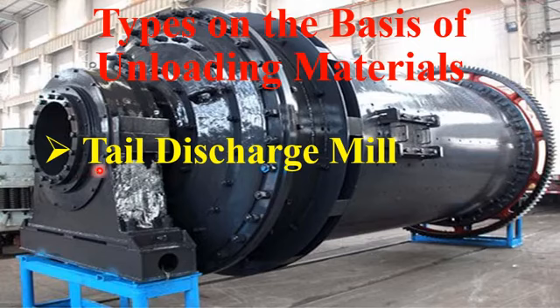So in tail discharge, the head and the tail of the ball mill drum are used as an inlet and outlet for the bulk material. Okay, when the mill is working, the material is fed from the inlet.